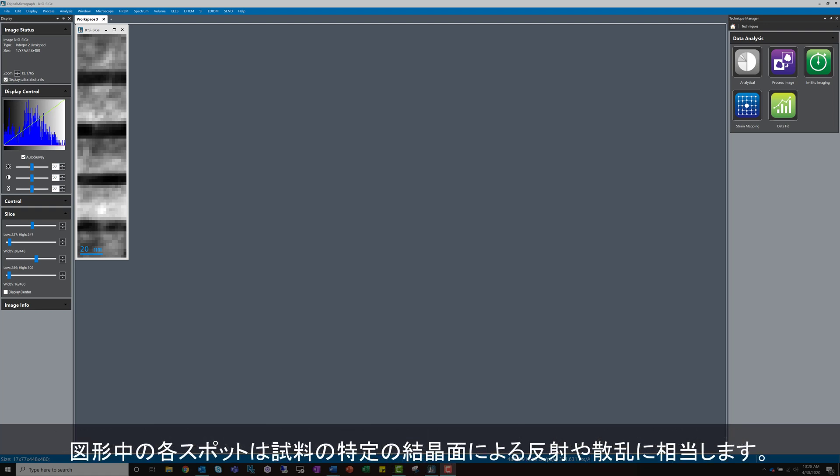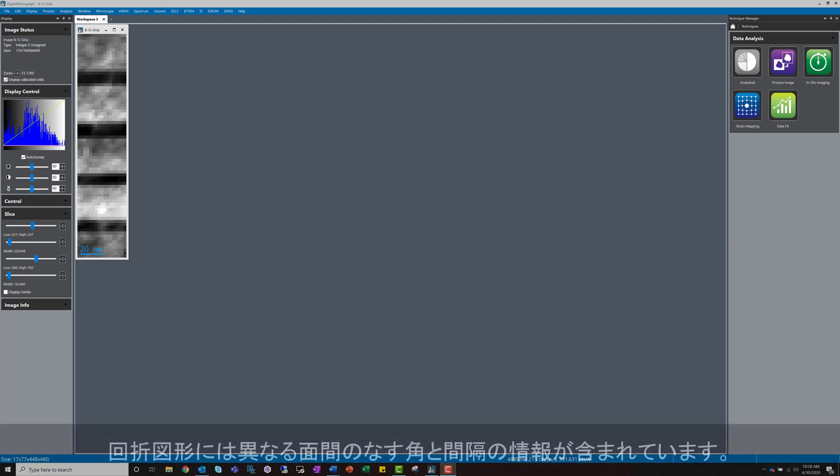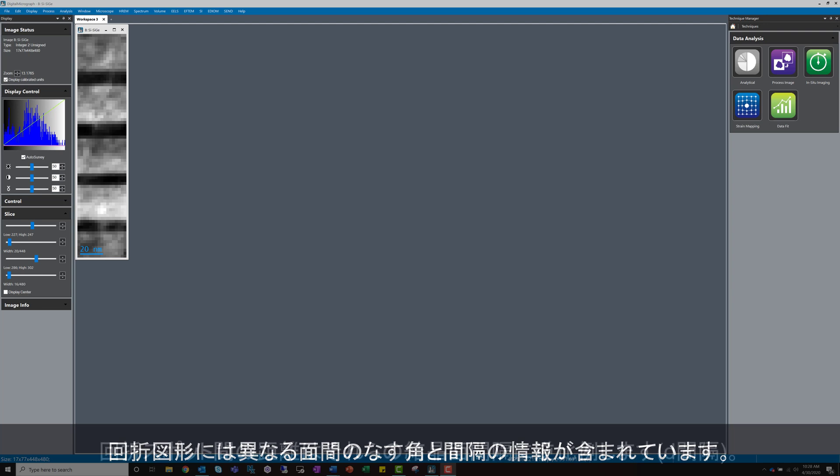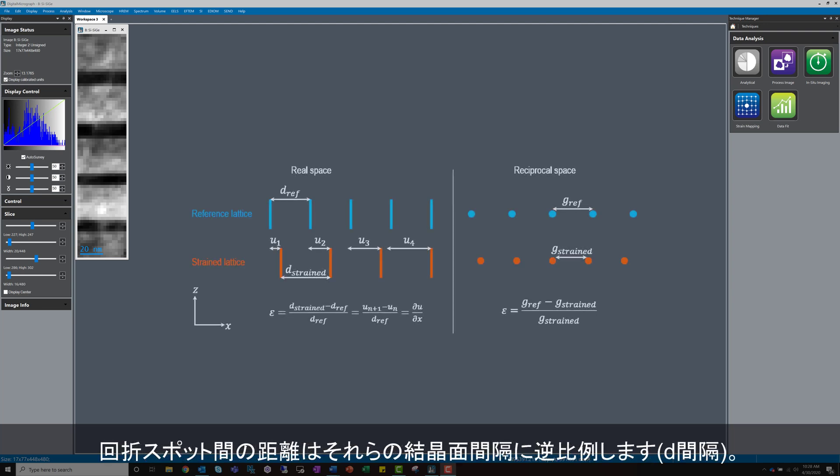Each spot in the pattern corresponds to reflections or scattering from a specific crystallographic plane in the sample. The pattern contains information about the angles between the different planes, as well as the distance between them. The distance between different diffraction spots in the pattern is inversely related to the distance between those crystalline planes, also known as the d-spacing.